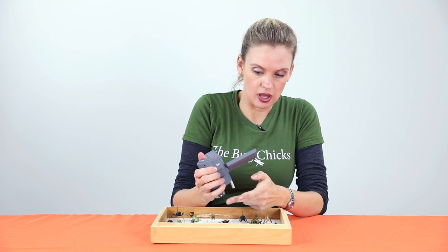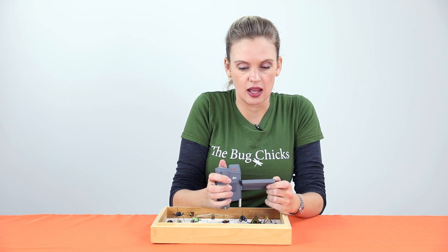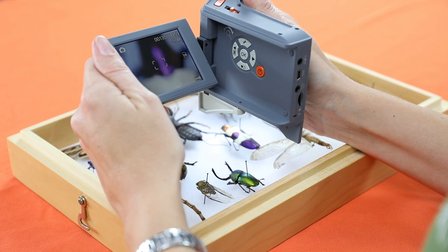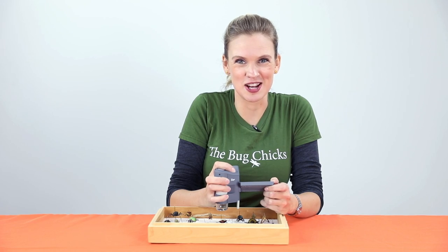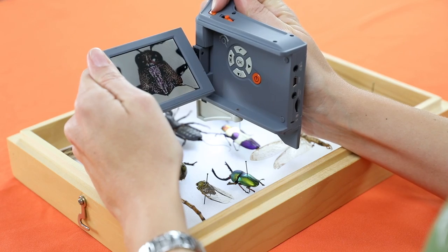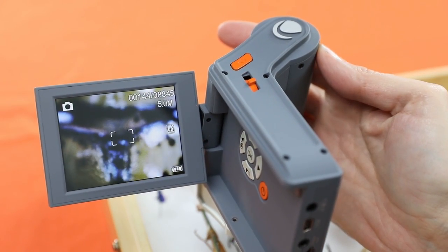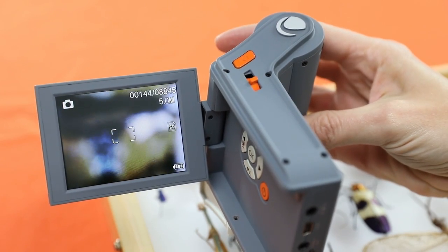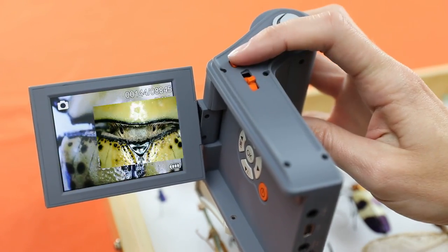I tilt the screen up and point the lights at what I would like to look at. Use the focus toggle — this barrel on the front — and take a great shot. If I want a little bit more light for a darker subject, just use the light on the side.